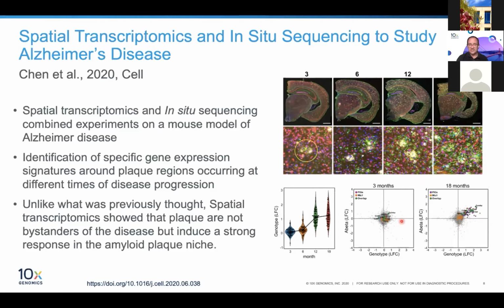So they've identified a series of genes that are indeed changed by the cells being in the periphery of those plaques, as compared to normal tissue, and they can follow those out over this 18-month period. Effectively, what they're identifying are all the standard genes you would expect to be changed, things like oxidative stress and those kinds of markers. So as a simple overview of a publication, I think this makes quite a nice introduction. They also run in situ in this for greater resolution ultimately.